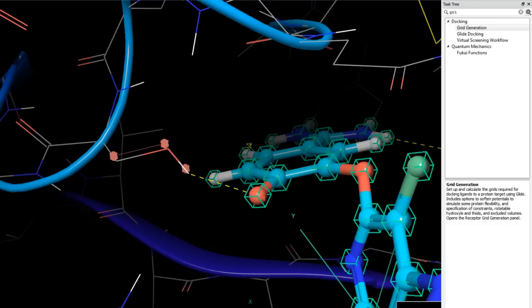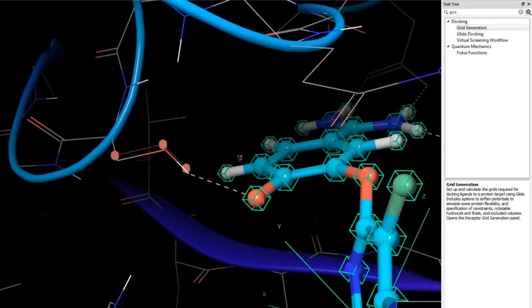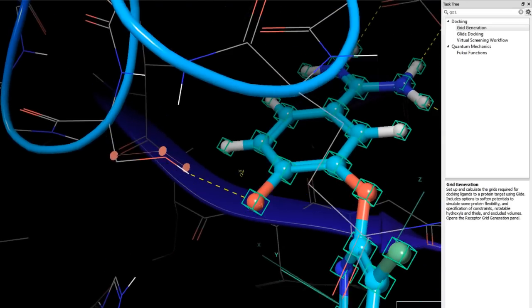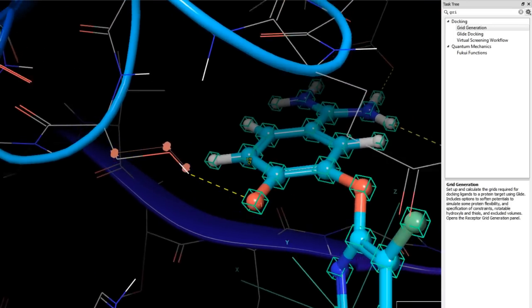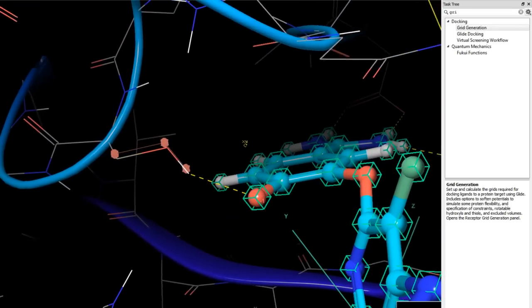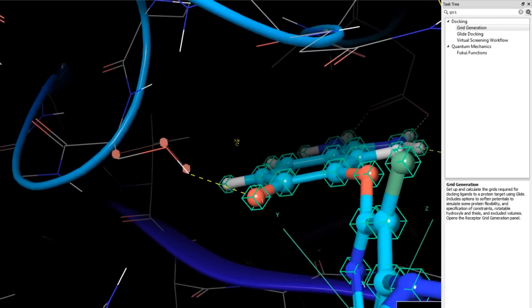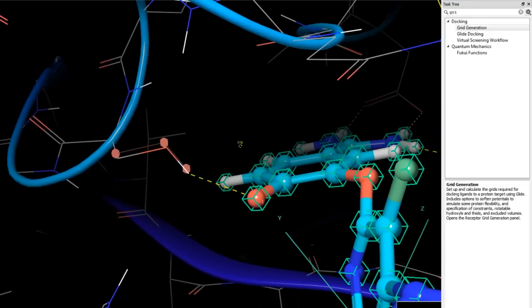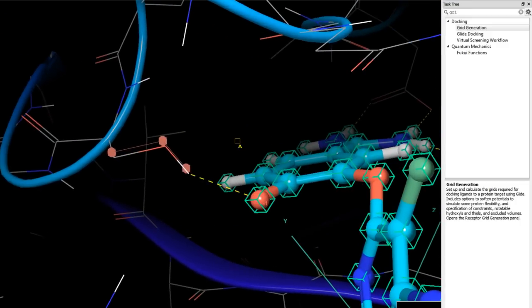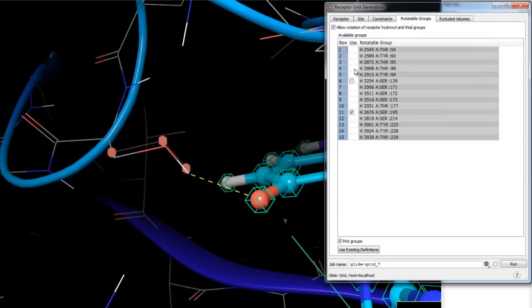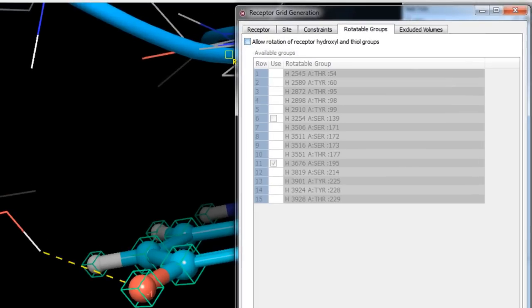In this example, given our confidence in the receptor structure from protein preparation and in the orientations of the rotatable groups — particularly the serine hydroxyl — we will not apply this option.